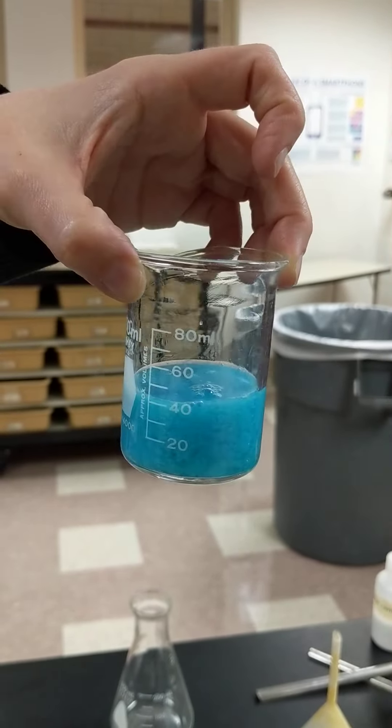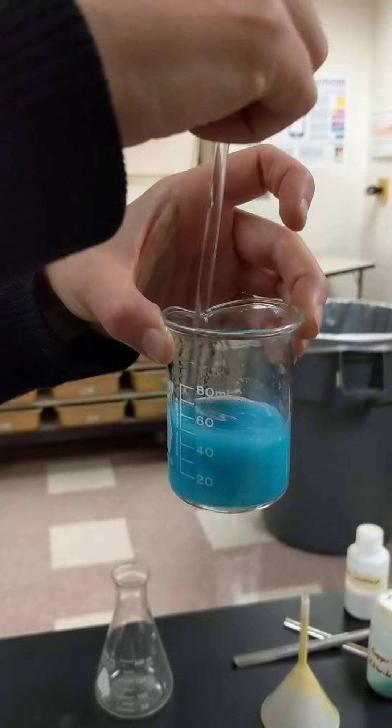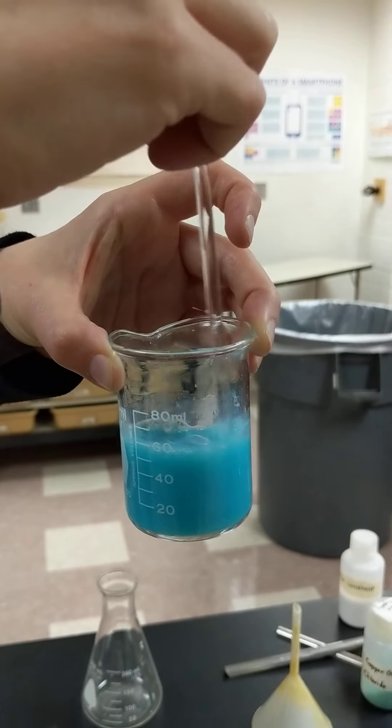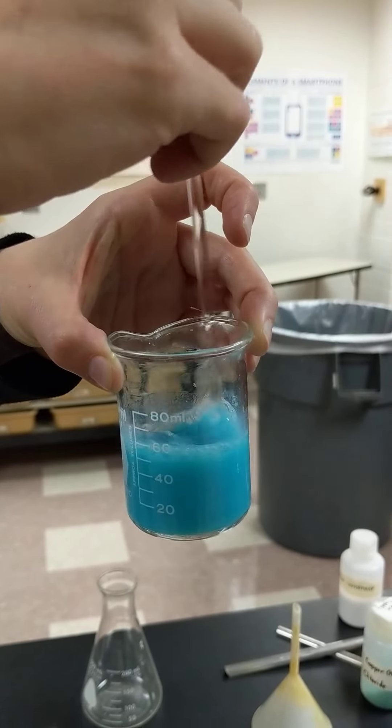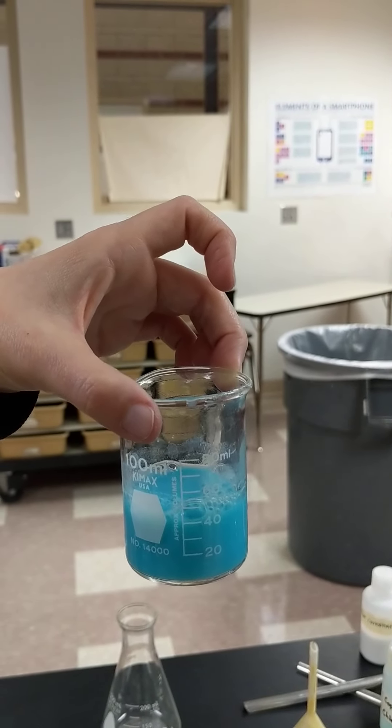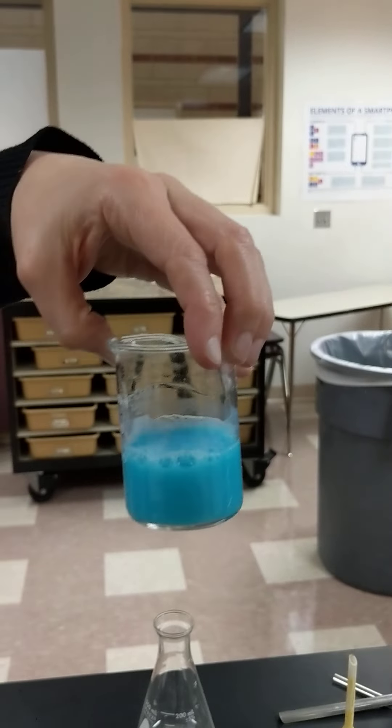And I will stir just to make sure that it gets all mixed together properly. It doesn't matter which stirring rod we use for this because they're mixed together. But that's what the observations look like now for the mixture. So you're doing it for the mixture.